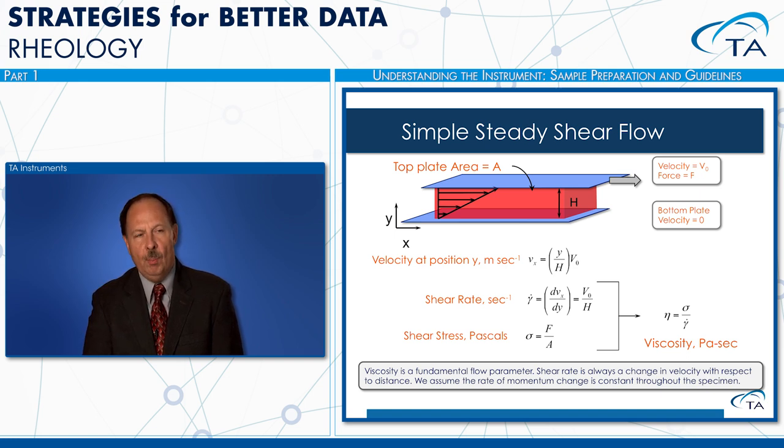Similarly, we want to normalize the force. And to do that, in this case, we just divide by the area of this plate. The units of force are newtons. The area would be square meters. And newtons per square meter are referred to as pascals.